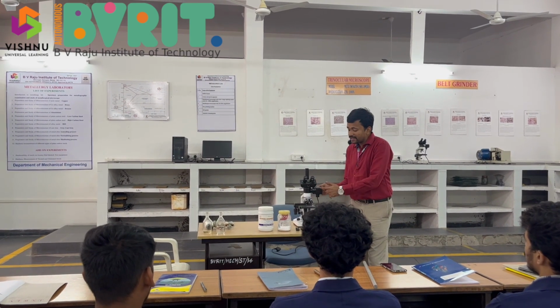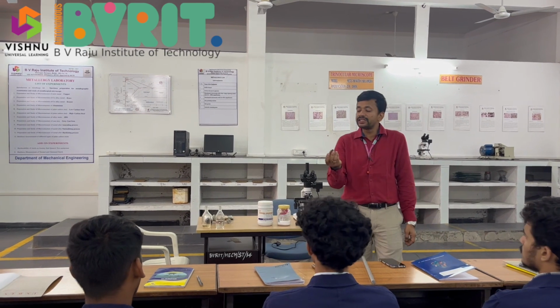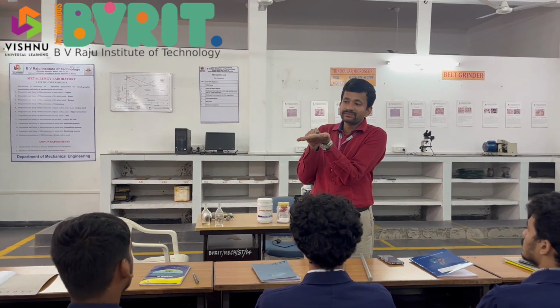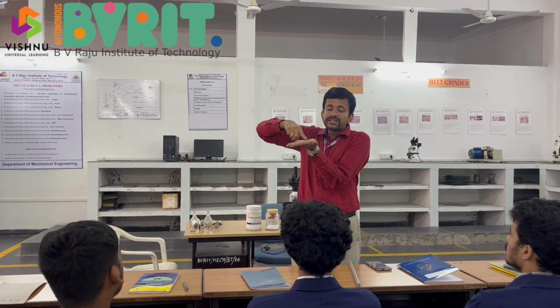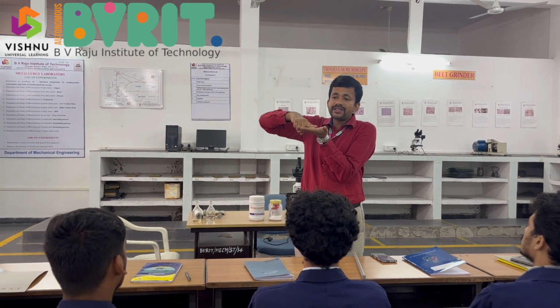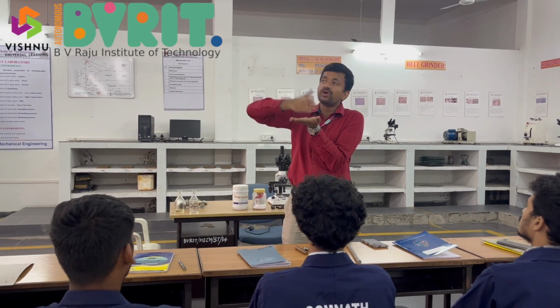When the light source is falling onto the specimen, suppose I take this specimen, you can see it is not flat. There are undulations, which will make the specimen surface reflect the light not to the eyepiece. It will go somewhere else.